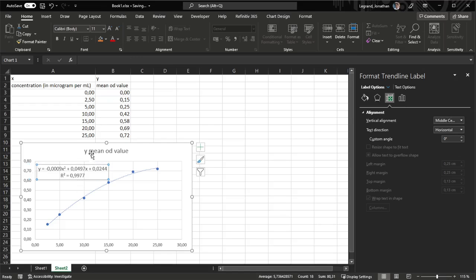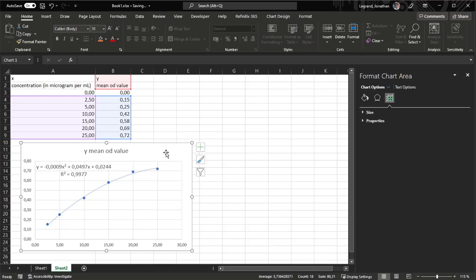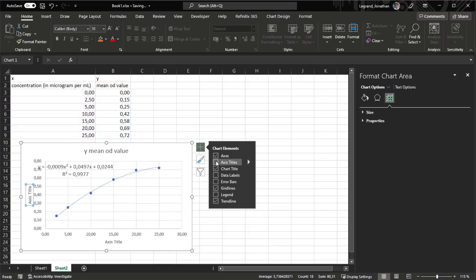It's quite important. Alright, so remember that we've chosen our y and our x depending on where we wanted it on the graph. But it's still difficult to see what is what on this graph, and I would always advise as a result to add axes titles.